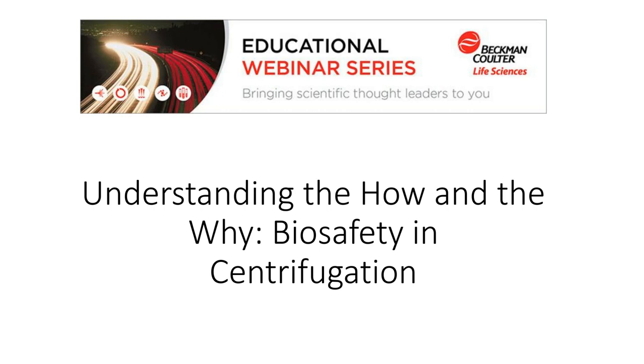Next question. How do you inspect a rotor and how do you clean it? I'll continue that. Laura, you can enter in if you have a comment. I was just going to say I mostly just look at it and clean it with water, but I know you'll do a better job of answering this.